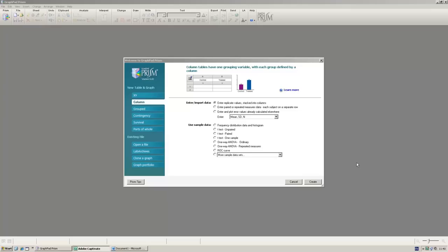Depending on how the computers are set up at this moment in time, most of them you can access GraphPad Prism if you go into the Start menu, and then it's probably under GraphPad software, and GraphPad Prism 6 is the latest version. The program is only licensed to the faculty, so it's only on the student computers in MA143. It's not in the main computers, for example in the Learning Centre or MIBook, so it's not licensed to the university as a whole. However, we will put instructions up.